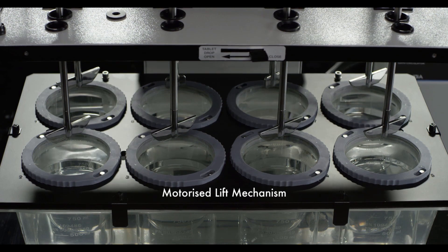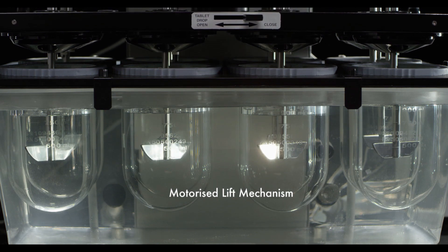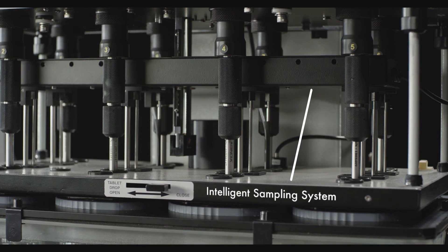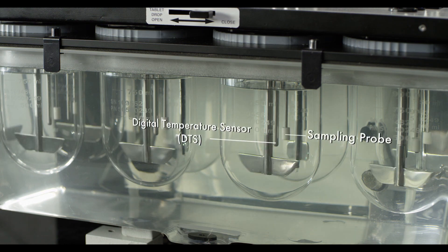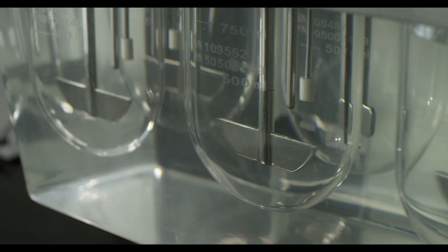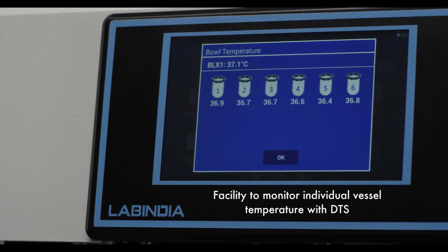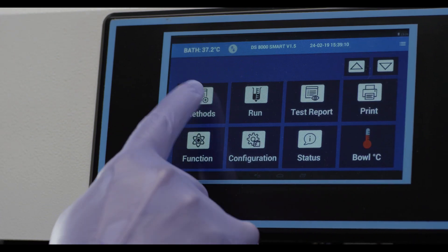The motorized lift mechanism ensures hands-free and quiet operation. The automated sampling is as per USP specifications; sampling probes are accurately moved to the USP sampling zone. The six-vessel temperature monitoring system automatically measures and records the temperature of each individual vessel at specified sample points. You can now set the program parameters.